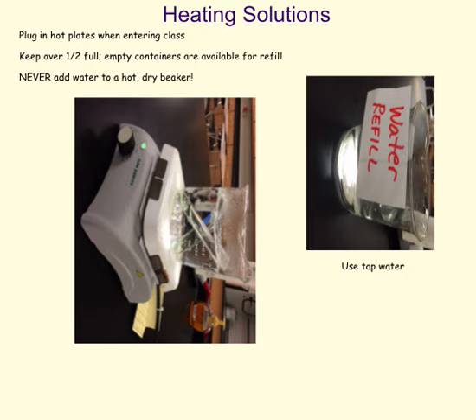Okay, heating solutions. We are going to be working with hot water baths, and we're going to have our test tubes in there. So it's going to be important for us to get those hot plates going as quickly as possible. So when you guys come in the room, please make sure that you go ahead and plug it in or turn it on, depending upon your hot plate type. But you can see in this picture, which again, we've got it sideways. We changed formats a little bit, and I guess it changed all the pictures. But you can see that we've got some test tubes in there, and they're heating up nicely.